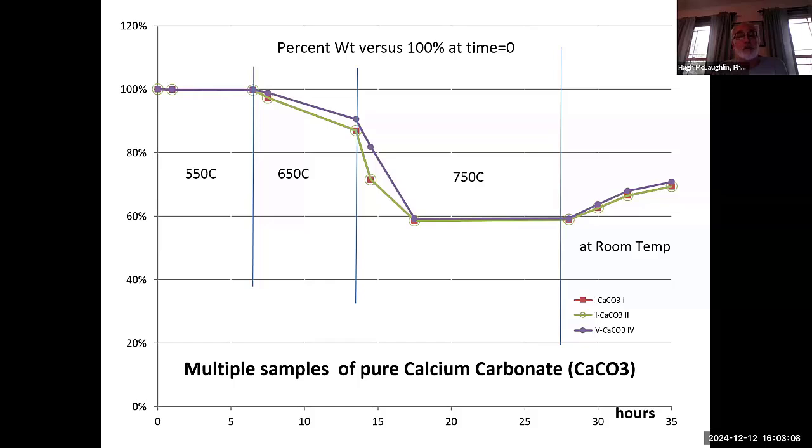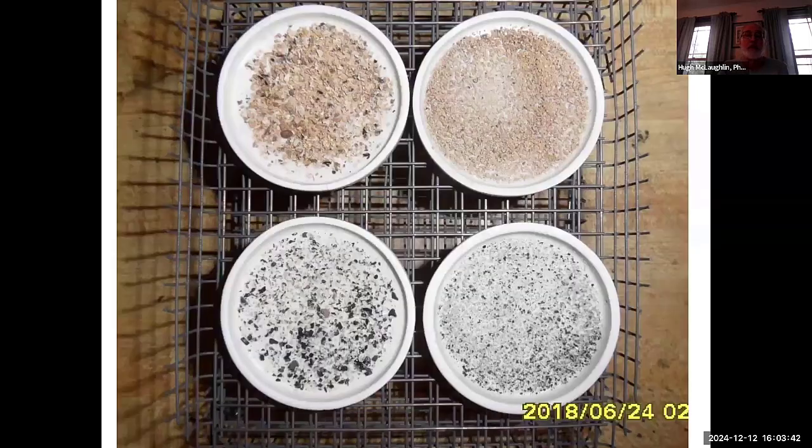And this is a real issue with labs that measure ash with the ASTM test, which is a coal-based test. Whether it comes on a piece of paper that says charcoal or not, it is developed around coal, in that it decomposes all the carbonates into calcium oxide and magnesium oxide. And that makes a lower ash measurement, and you really end up attributing that lost CO2 to some other class, typically the carbon class, the organics class.